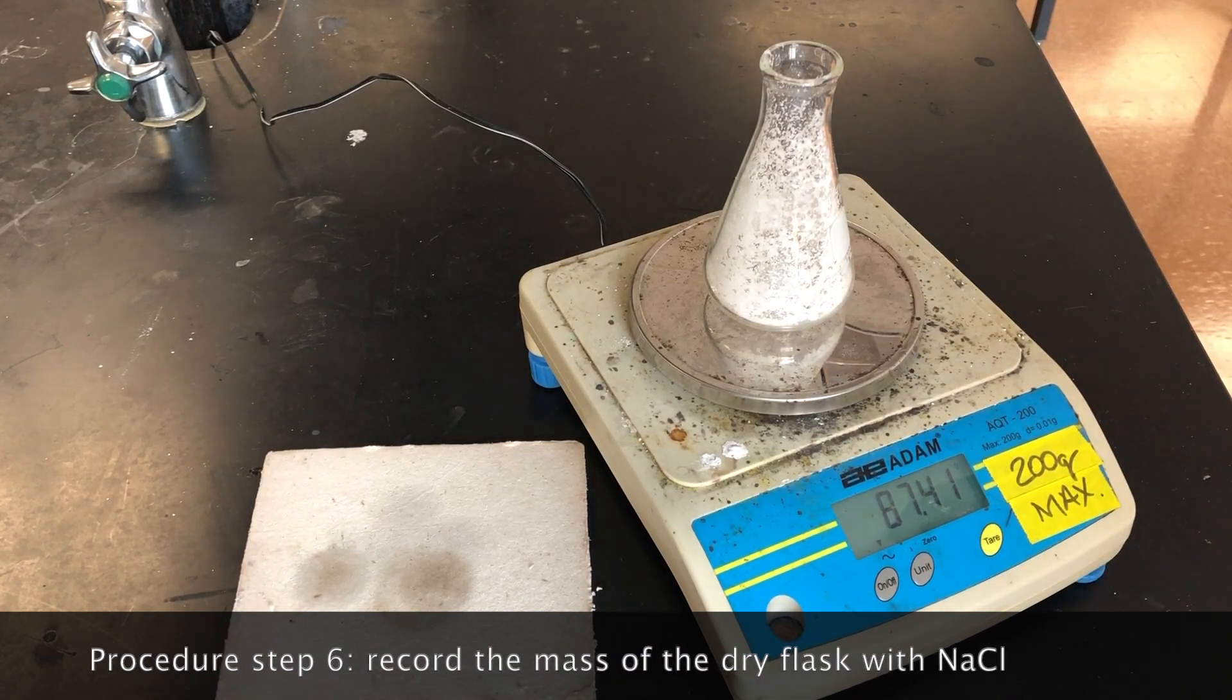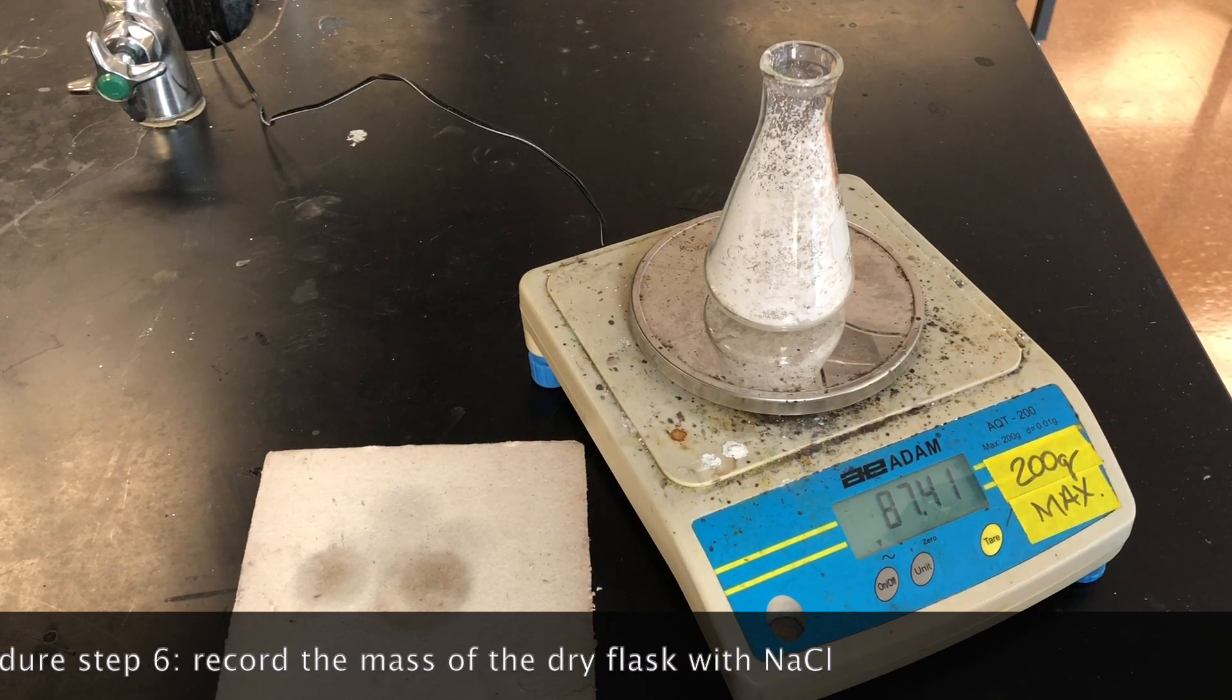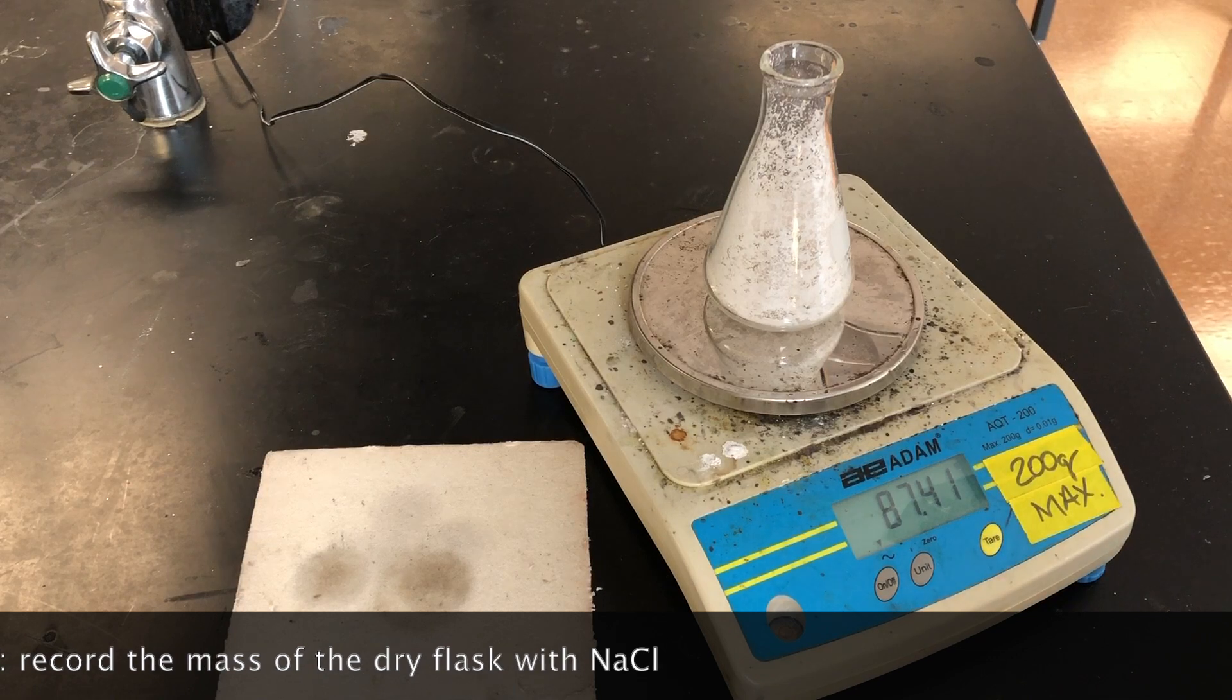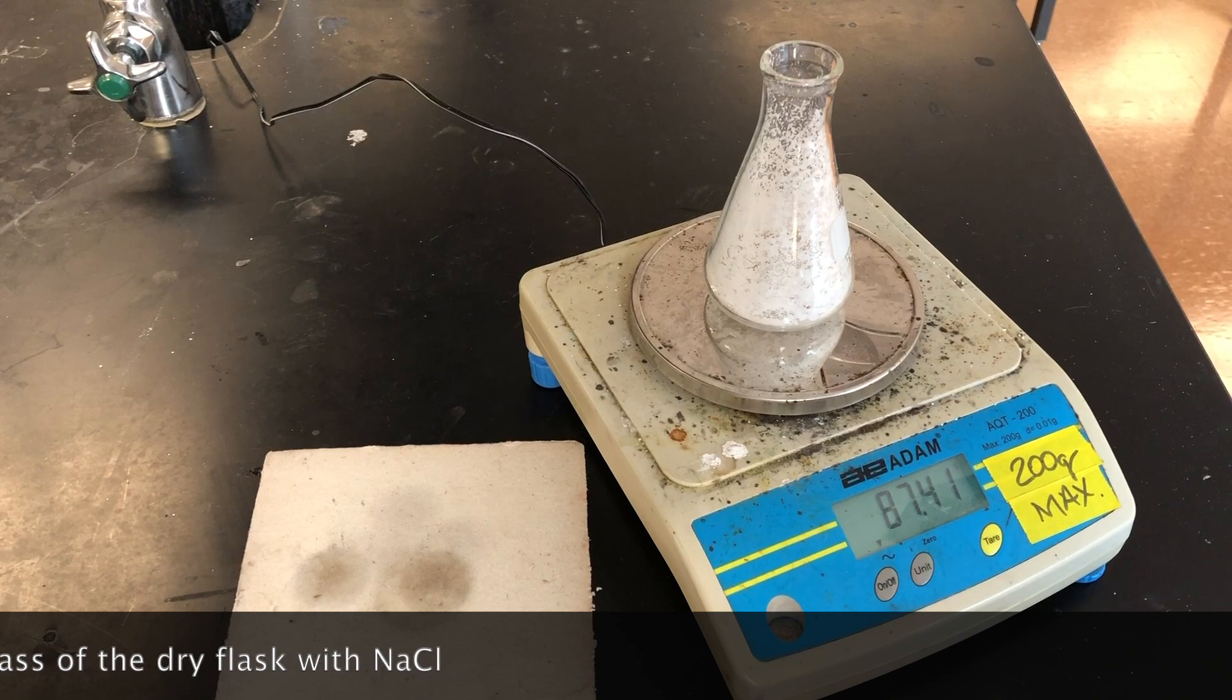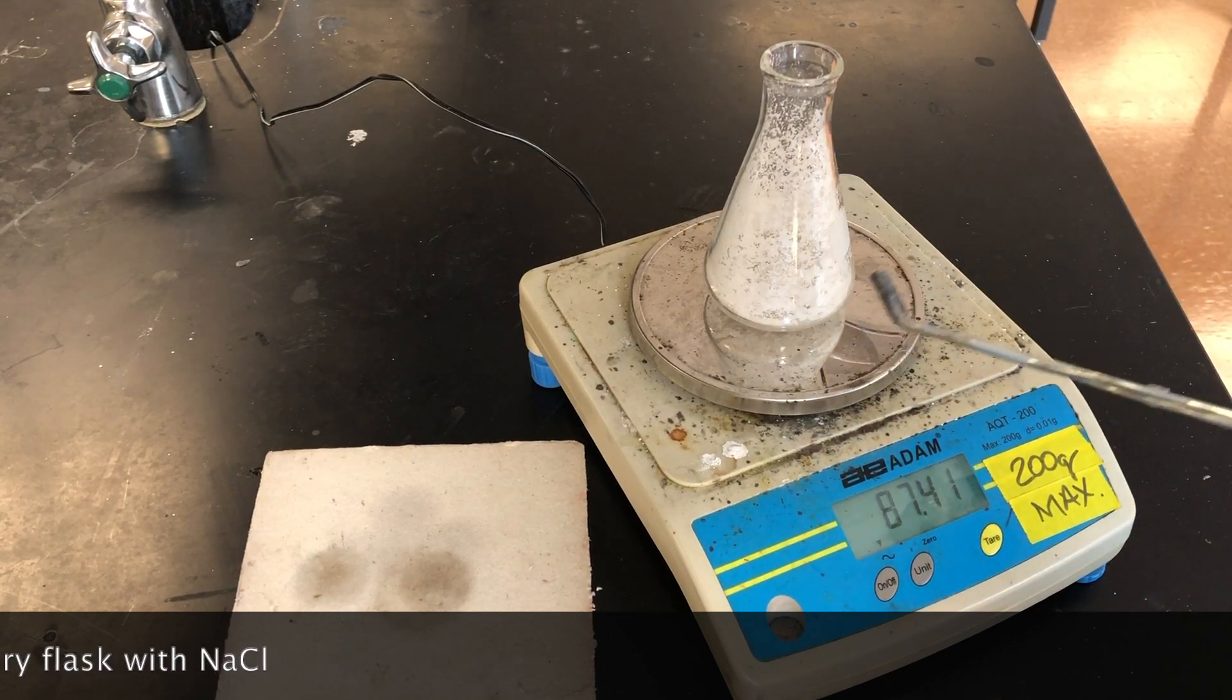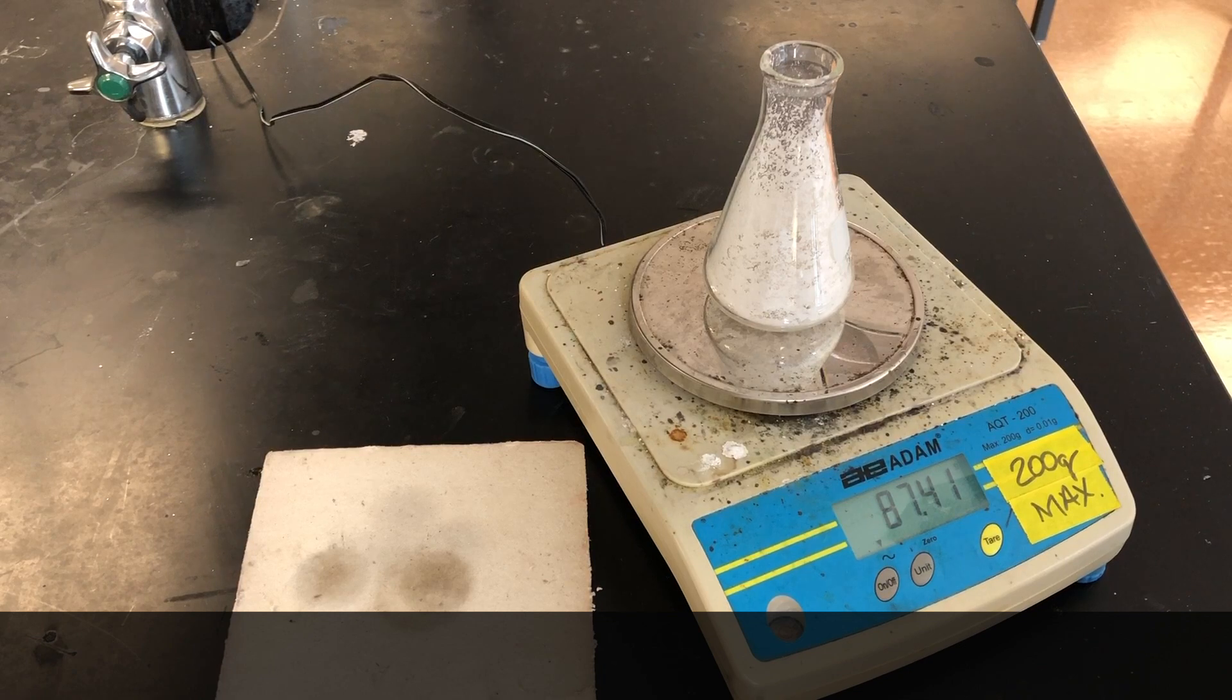We can take the measurement of the Erlenmeyer flask and the sodium chloride that is left in it. We have a value of 87.41 grams. 87.41 grams. You can see that it was quite useful to find the mass of the Erlenmeyer at the beginning, before we started this reaction, because there would be no way now to measure the mass of the sodium chloride produced any other way.